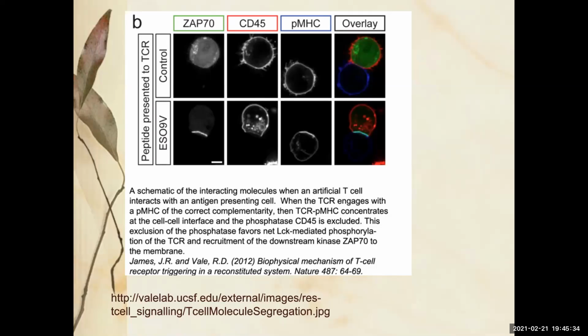But the point is you have each channel, preferably as a black and white image. It's okay if you've colored it back with the lookup table, but you probably acquired it as a black and white image if it was fluorescence in a fluorescence scope. And then you do the lookup table to get the nice color for the overlay, and you merge 3 channels. You're going to do this in lab next week.